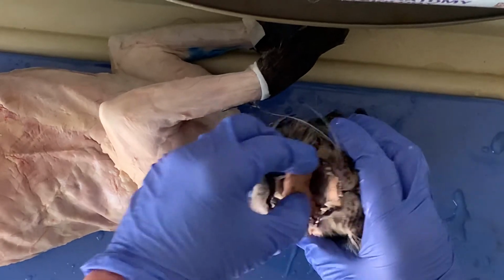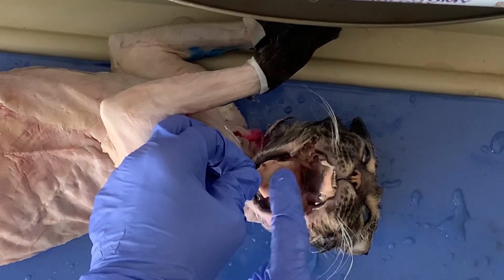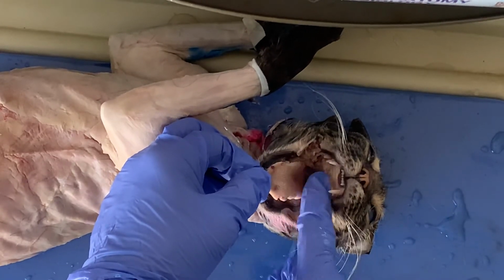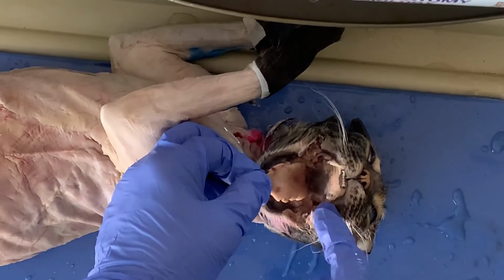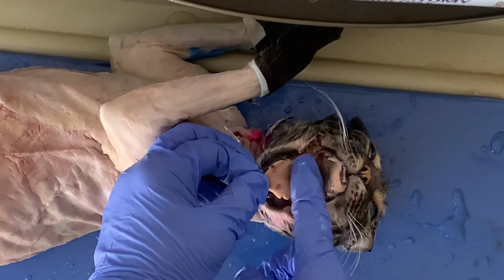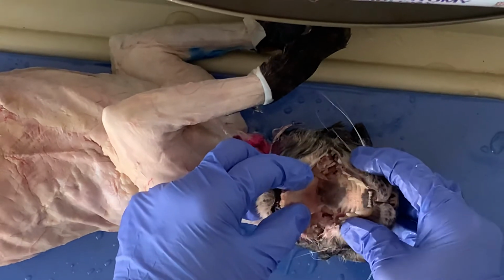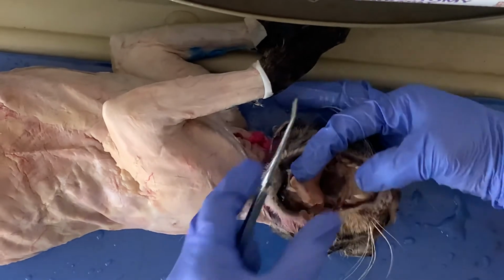And then on a cat's tongue, just like ours, we have all these different types of papillae, and theirs are really, really rough and spiky. So if you've ever heard or seen a cat clean itself or had it lick you, it feels very rough like sandpaper. That's because they have to be able to get stuff out of their fur and clean themselves. Ours are different shapes and in different areas, but we have different papillae also, and ours are for housing our taste buds.